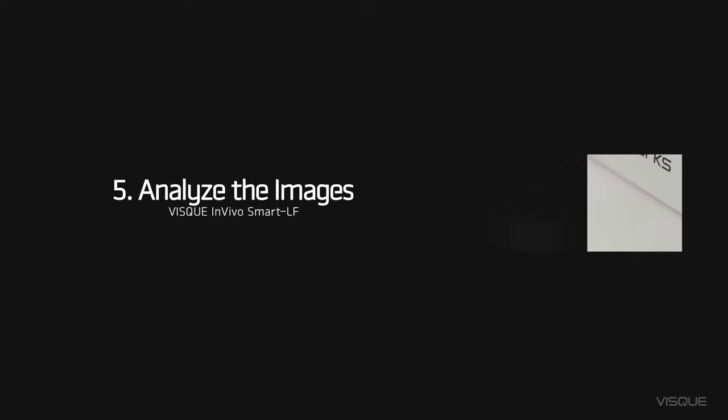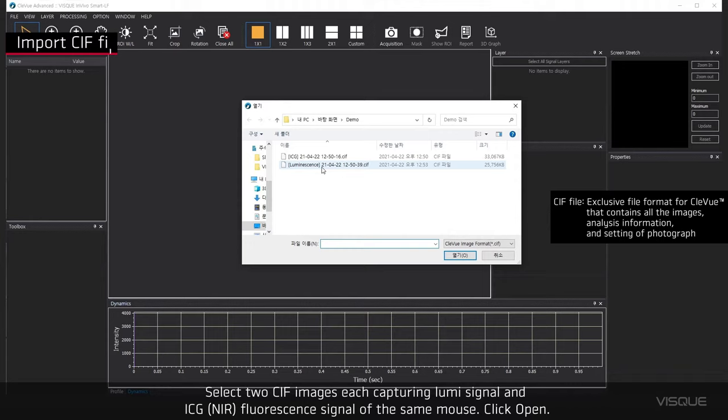Select two CIF images, each capturing Lumi signal and ICG Fluorescent signal of the same mouse. Click Open.